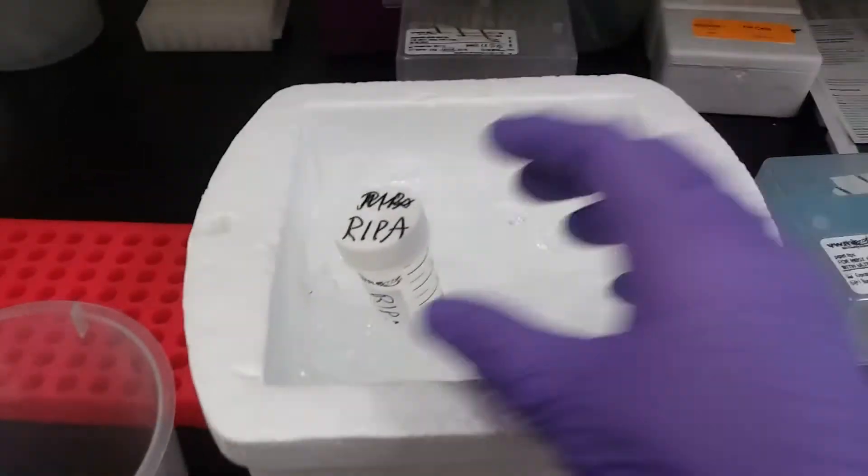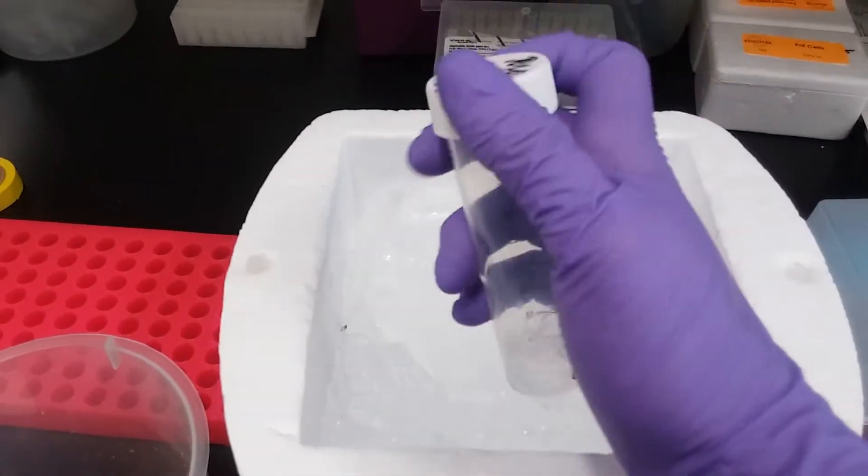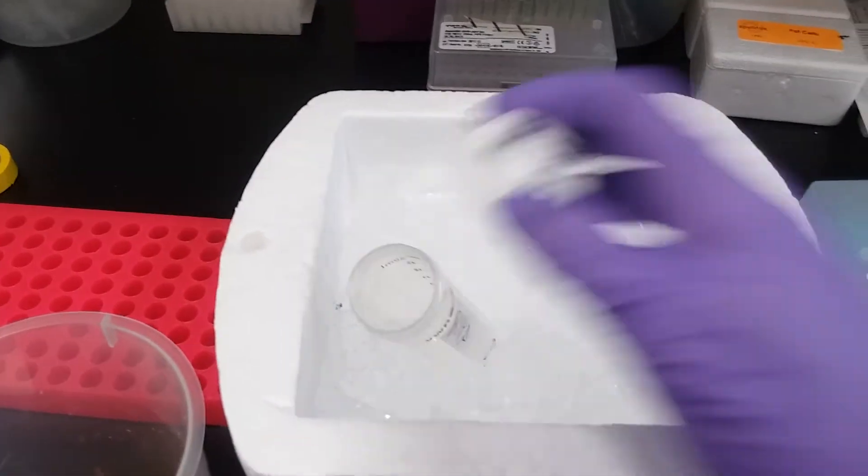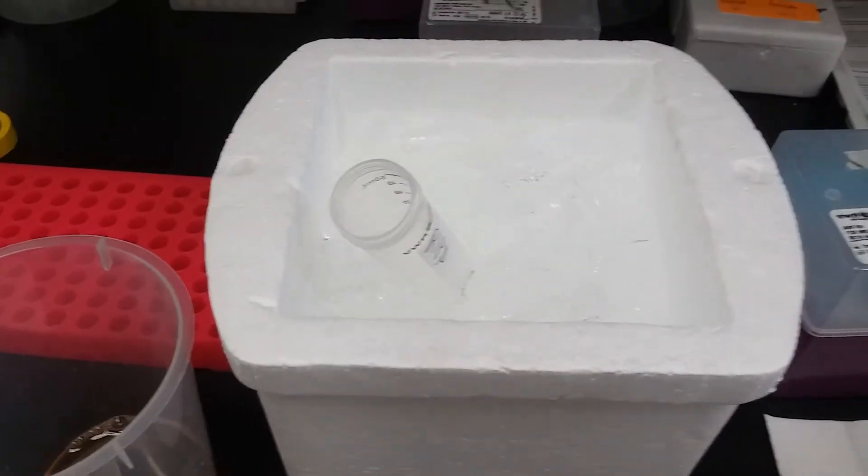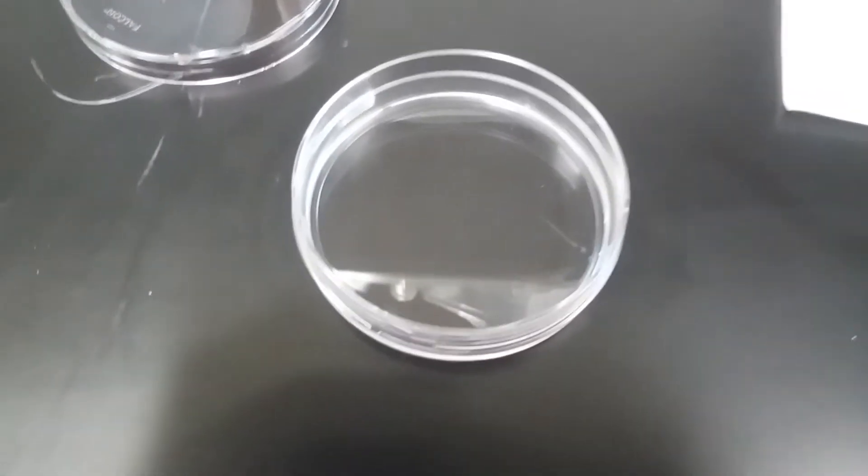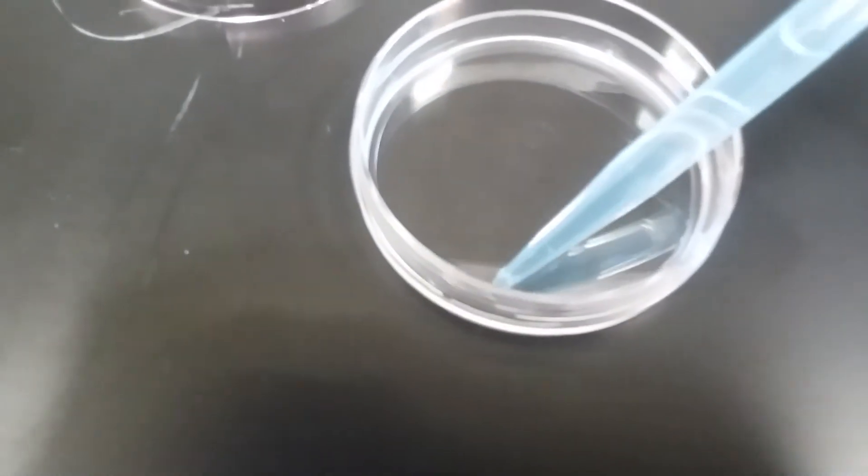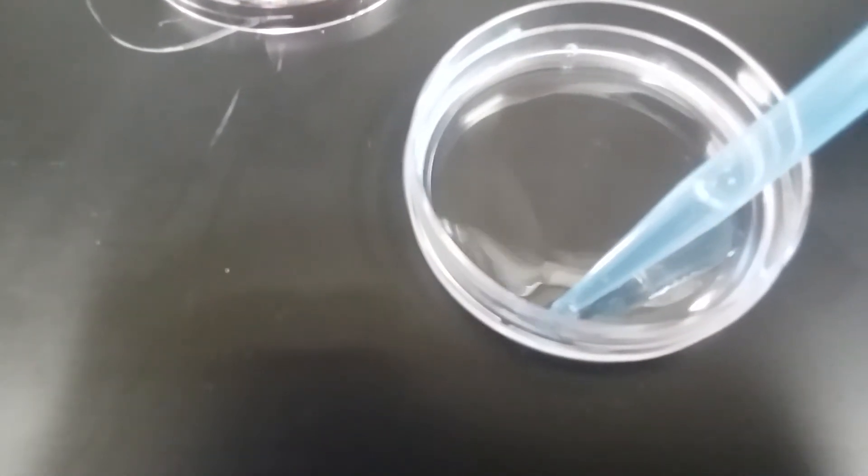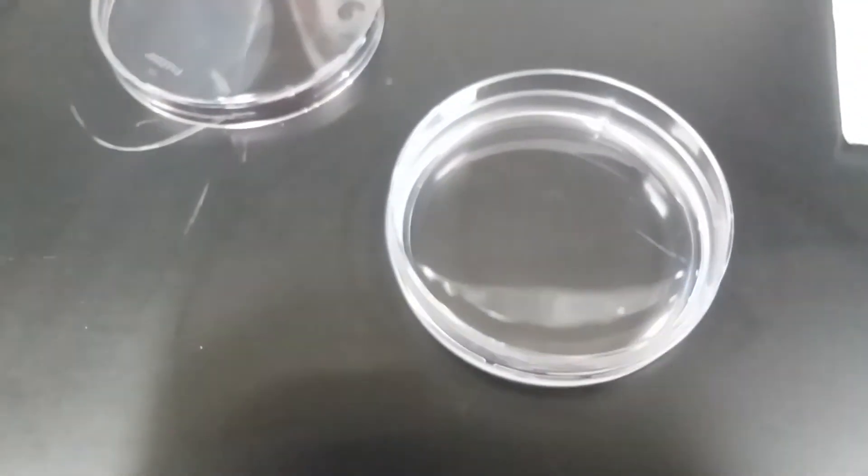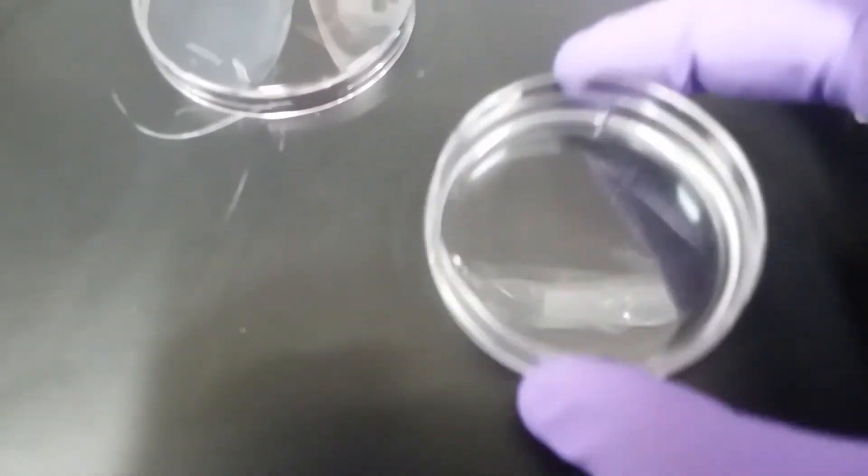And now I'm going to grab 900 microliters of my RIPA from my cold, and I'm going to dispense that onto my cells. When I put this onto the cells, I like to drizzle it on the side. I don't want to directly put it into the middle. I end up making a bunch of bubbles, so I'm going to put it onto the side, and I'm going to swirl it.